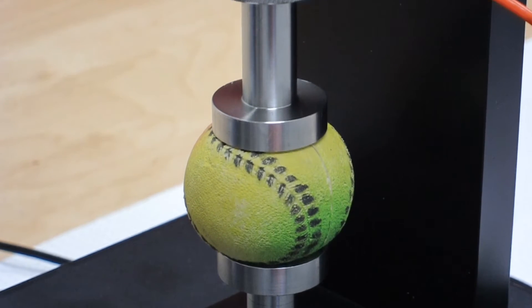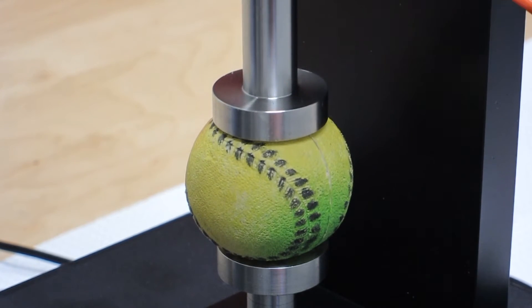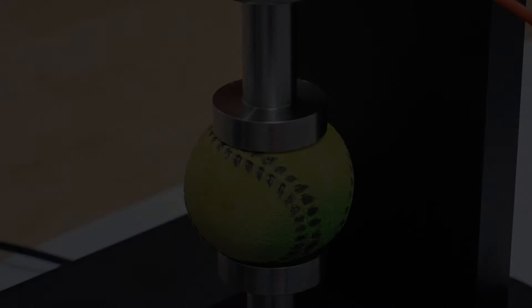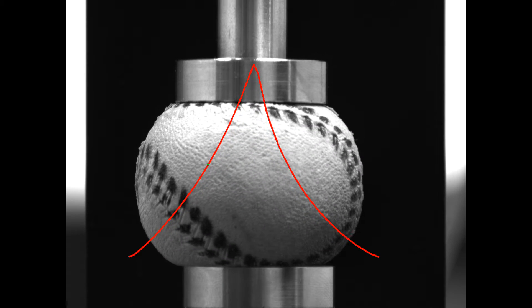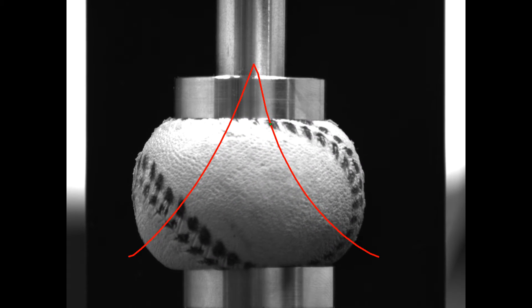Let's start by looking at the classic example, a parallel plate compression test of a rubber ball. This ball is about 50 millimeters in size and we're applying about 200 Newtons of force to do the compression.